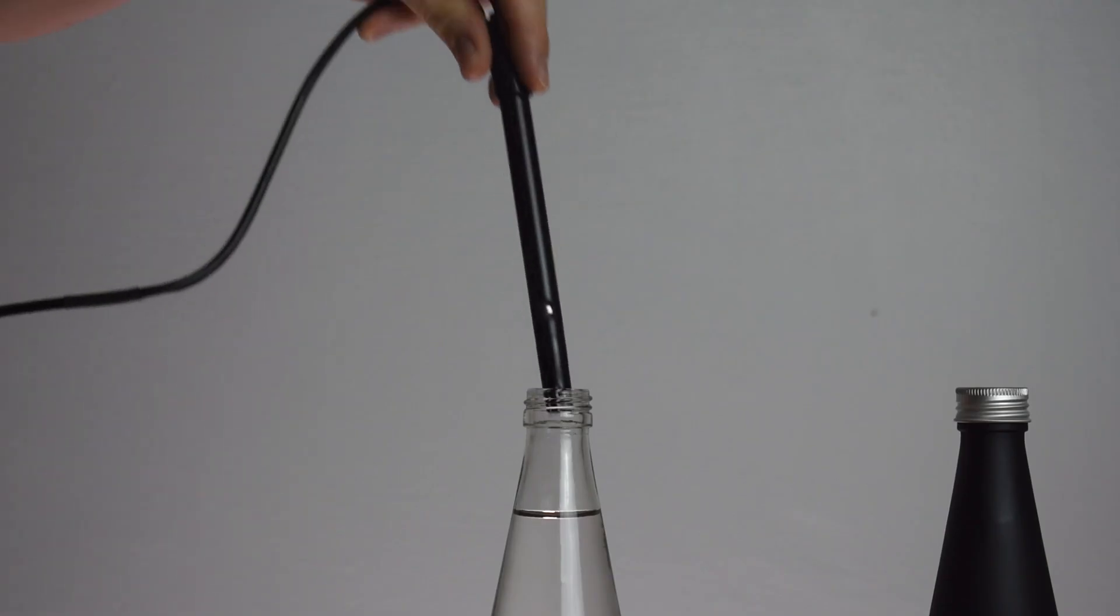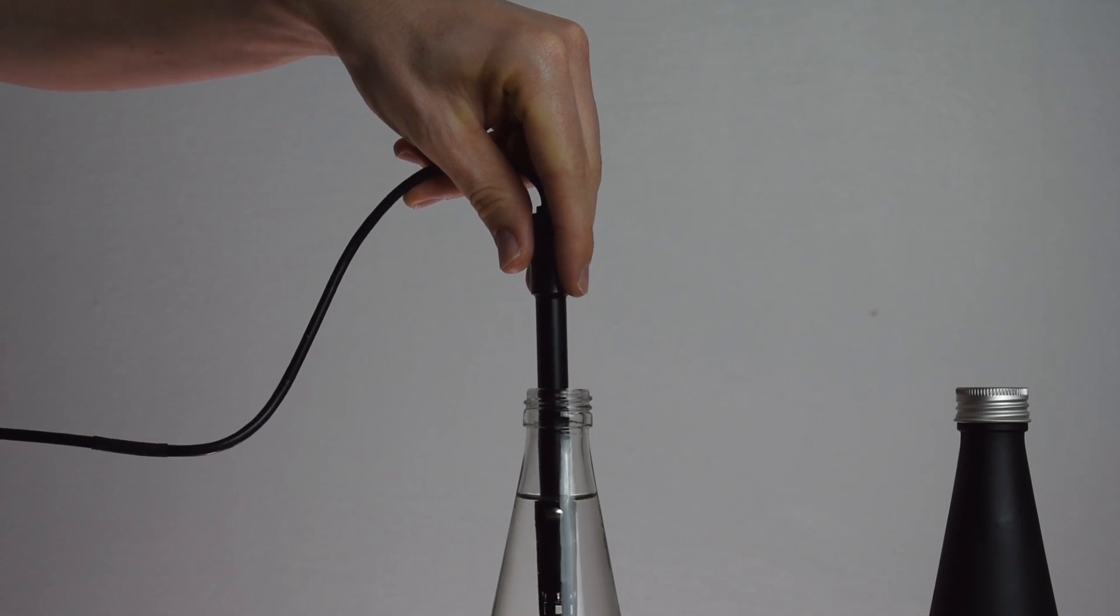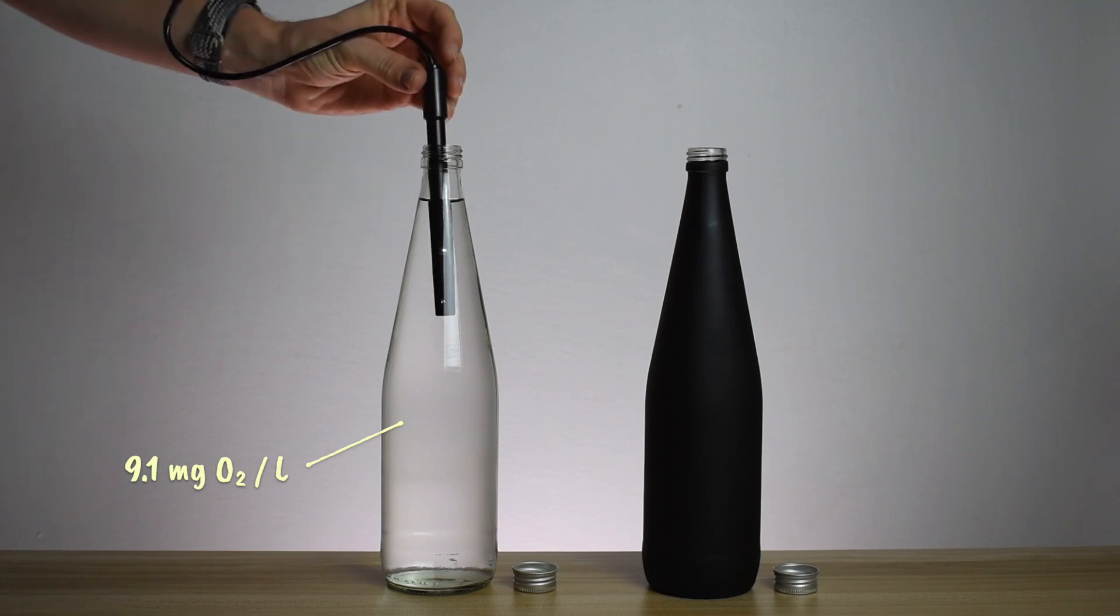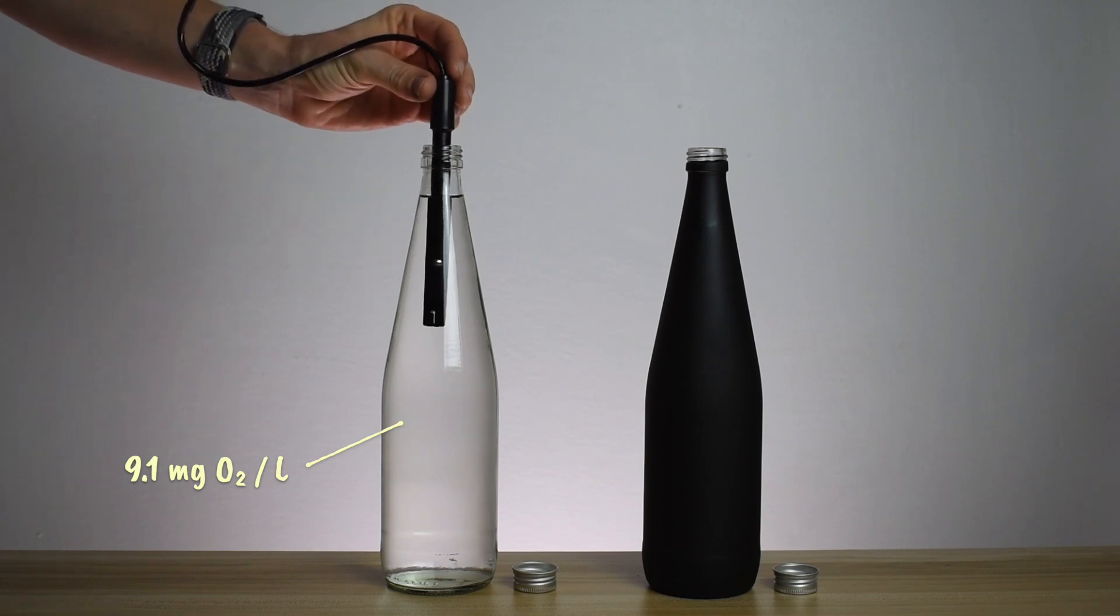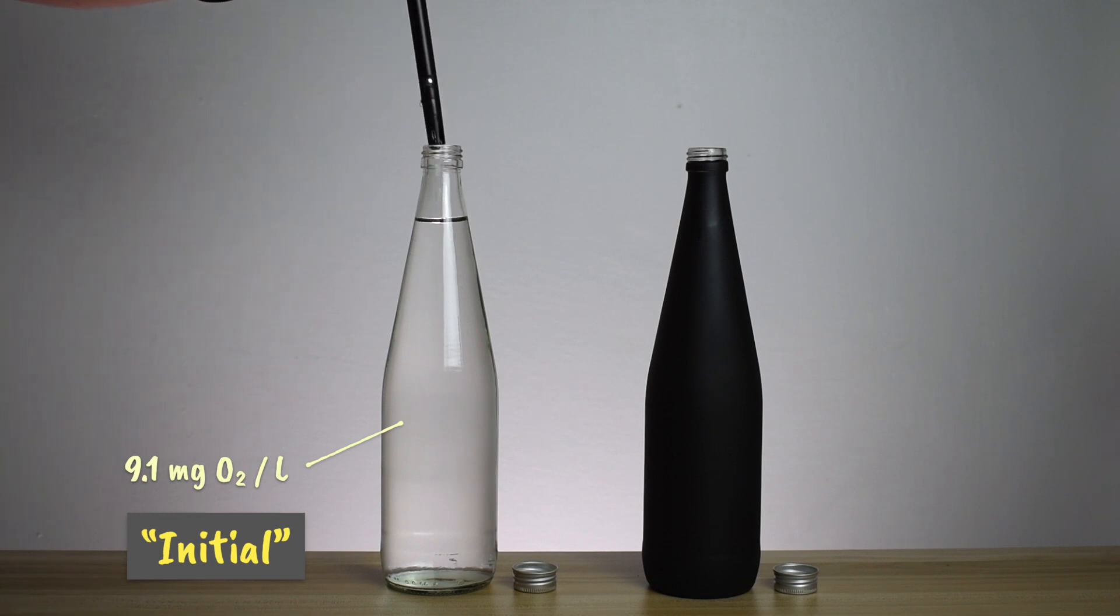As soon as you take the samples, measure the dissolved oxygen level with the dissolved oxygen meter. This water has a level of 9.1 milligrams of oxygen per liter. This oxygen level we'll call initial. You only need to do this measurement for one of them because they should logically have the same oxygen levels if they came from the same place.